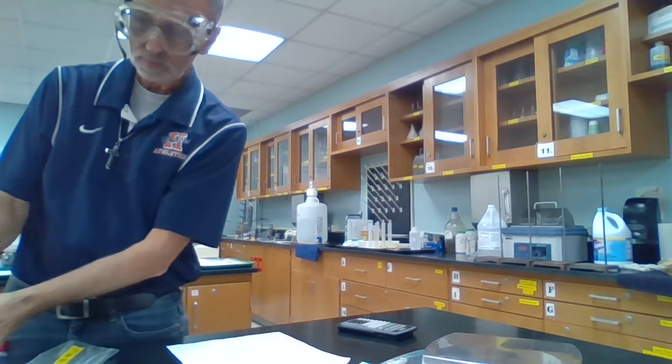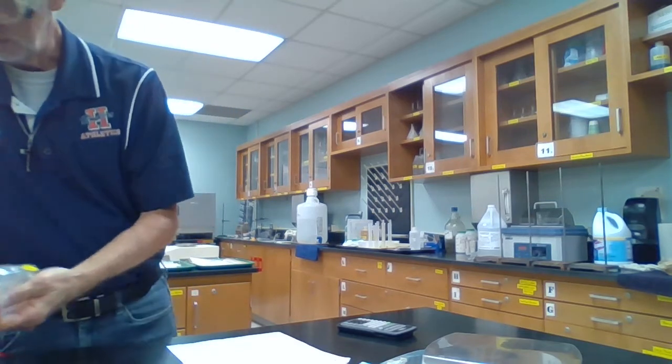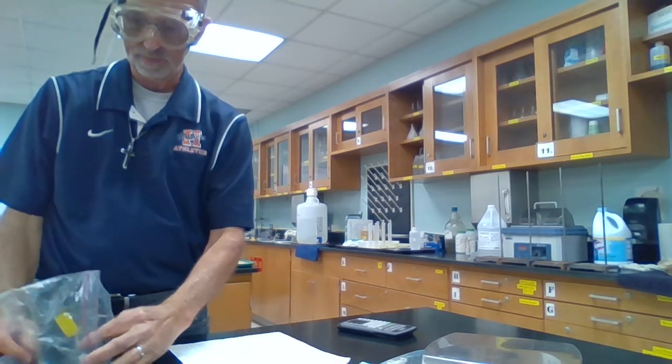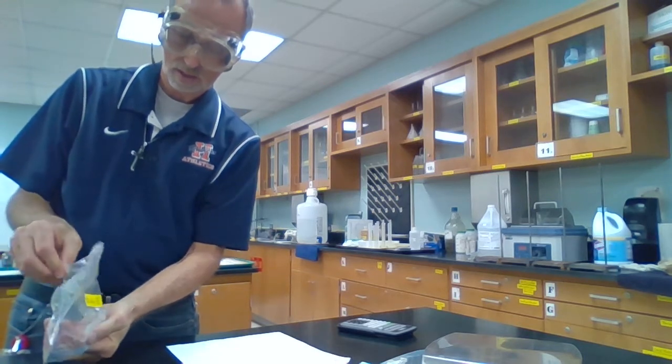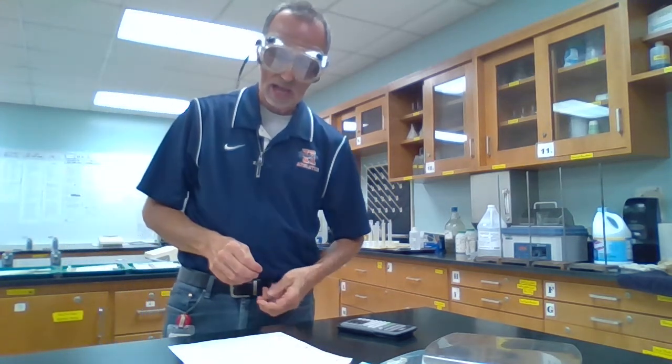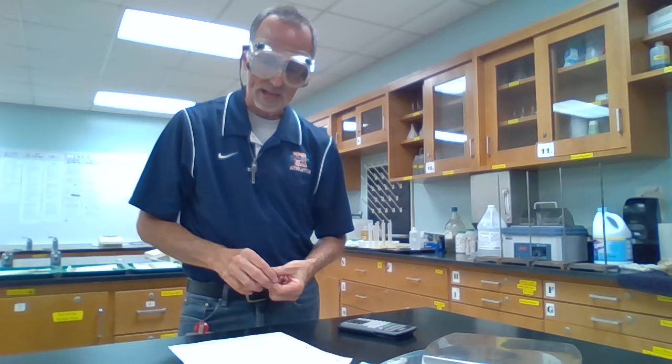All right, well, let's find the masses first of our newer pennies, those minted after 82. All right. So again, same size as the original, so the volume is the same. The volume of the penny itself is the same.